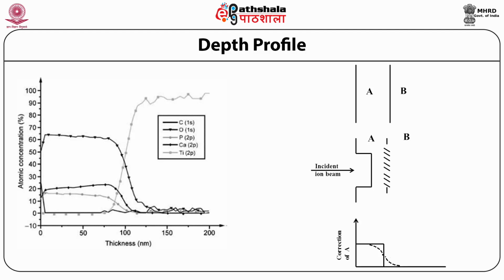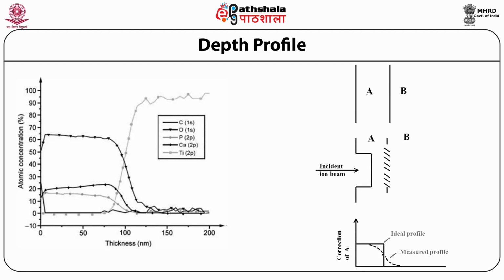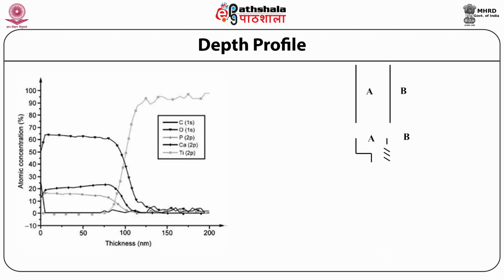The consequence of this phenomenon is that the preferential etching occurs in samples containing multiple elements. In samples comprising several elements which are not uniformly distributed, certain areas are etched faster than other areas because of preferential etching. This results in a rough crater surface generated with increasing depth of etching.